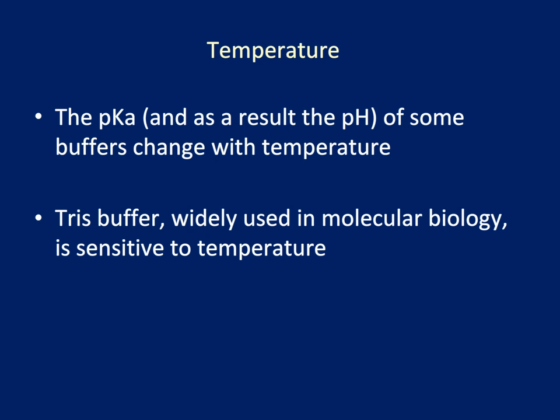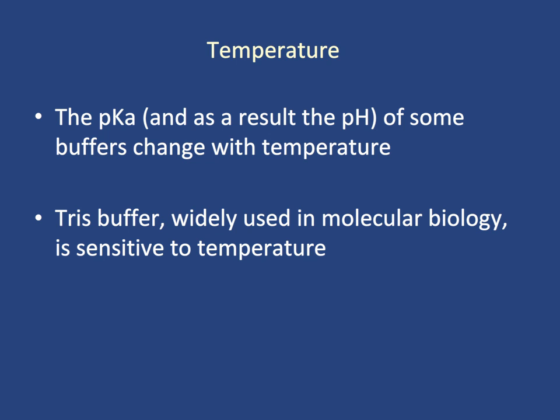One last note to consider. Some pKa's of buffers are temperature sensitive, so that the buffering range and pH at room temperature is different than that at 40 degrees Celsius. Tris buffer, which is a widely used buffer in a biochemistry lab, is sensitive to temperature.